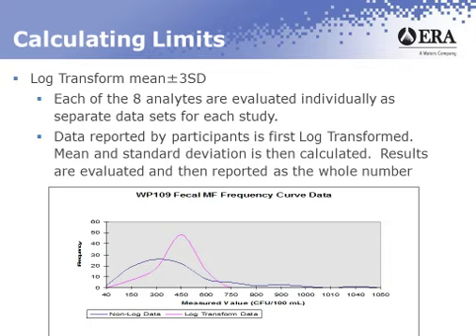It's critical that you do this. If you don't do that, you're really going to discriminate against certain data points. So it's important to keep in mind that all the PT providers are evaluating the data by the NELAC criteria that were given, and this is specifically what needs to be done with the data.